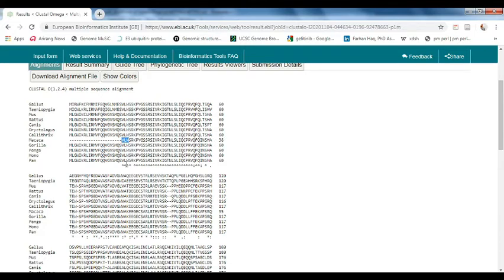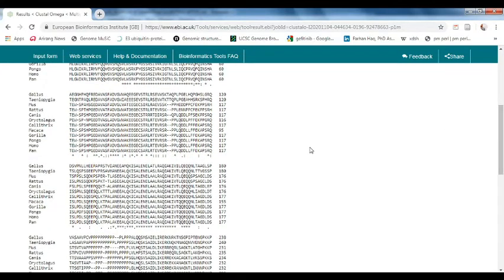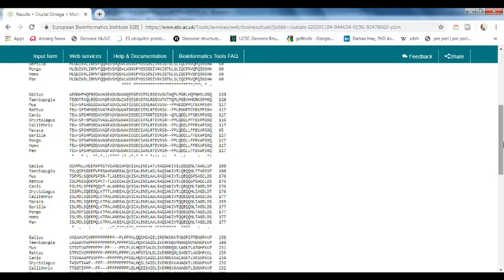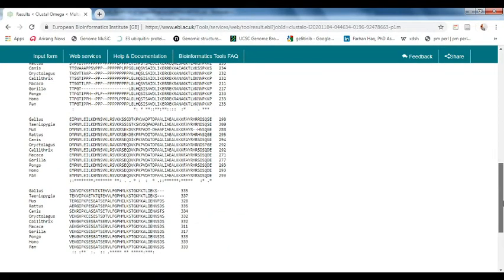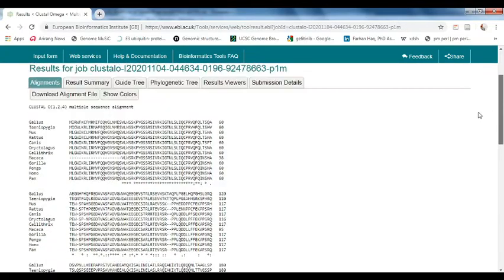Starting from a certain point, all sequences are almost 100% conserved, though there are slight variations at some positions. The alignment symbols have specific meanings: an asterisk means all sequences are 100% conserved at that column; a colon means there is some variation at a site; and a dot means there are more than one type of variation — for example, T, A, and V are all present at a single site.